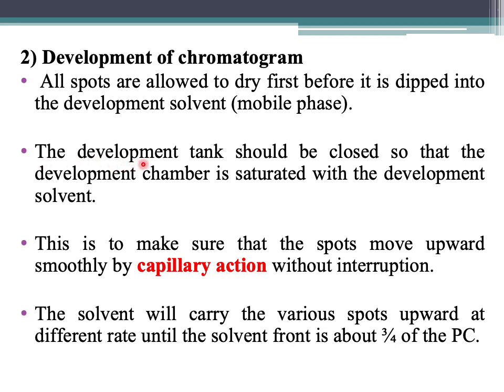The development tank should be closed so that the development chamber is saturated with the development solvent. This is to make sure that the spots move upward smoothly by capillary action without interruption. We do not want any interruption, so that is why we need to close the tank.